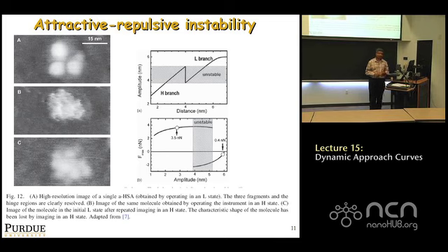This is a soft sample. This is an antibody sitting on mica, and this antibody is interesting because its shape actually has a trilobed structure. All right, and again, they do an approach distance curve. There's a jump that happens. They choose three different. They choose on the top is an image taken with the net attractive regime of operation, right? Net attractive oscillation state, and the topography shows you the three lobes very nicely, right?